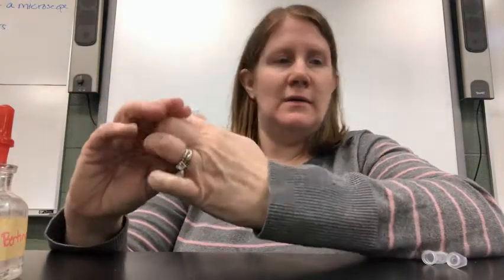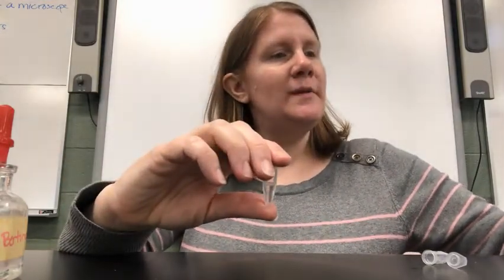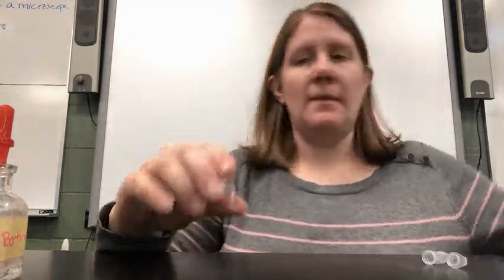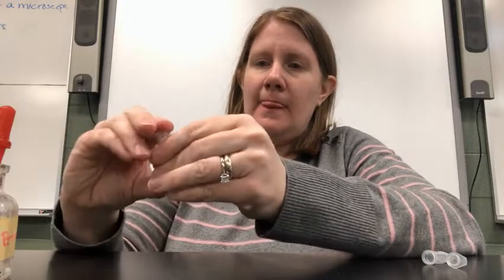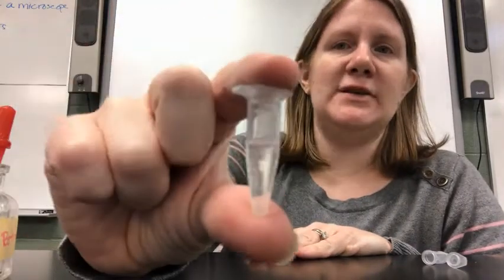Close both vials. I'm going to invert my tube. Now I'll open it up, put some testing solution in, invert it again, and there you can see the results for suspect 1.